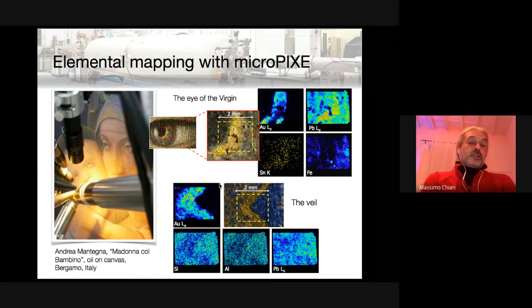The application of external microbeam with the possibility of collecting elemental maps is indeed important, especially in this case more than in the application on aerosol samples, where single particle analysis is not so important.